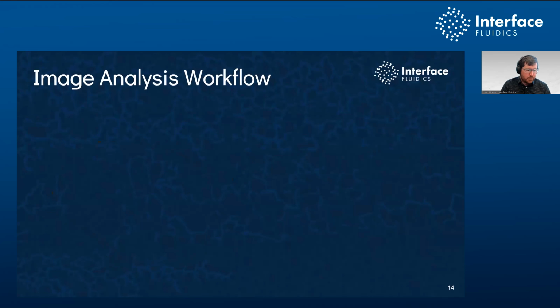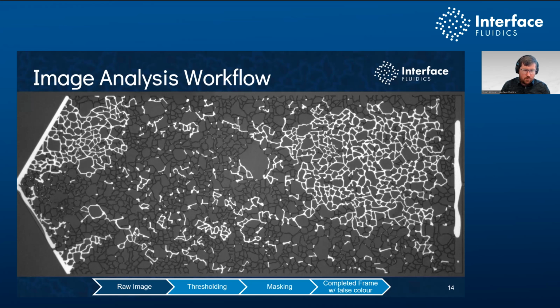So I mentioned before that we do almost all of our data collection through image analysis and through video analysis and machine vision. So what that workflow actually looks like is we start with a raw image. So the raw image that you see on the screen here, this is what our camera captures. And you can see the bright white, that's your oil fluorescing. And then all the dark channels are where the water or polymer has displaced that oil.